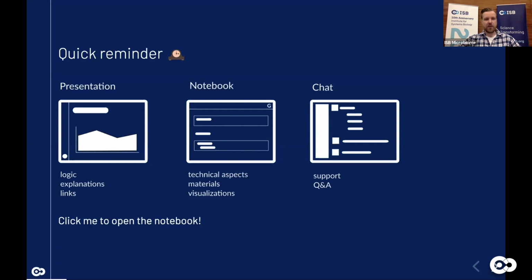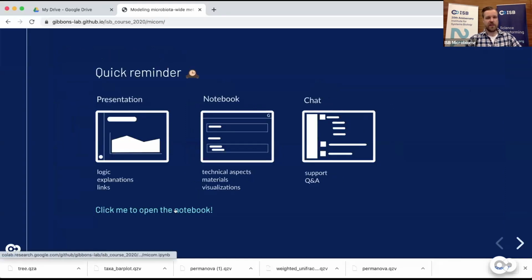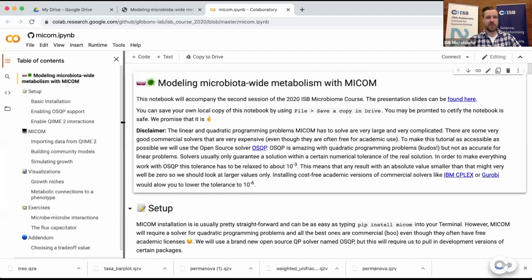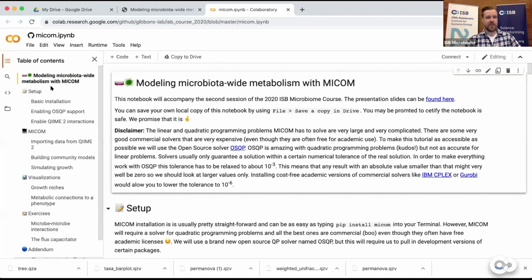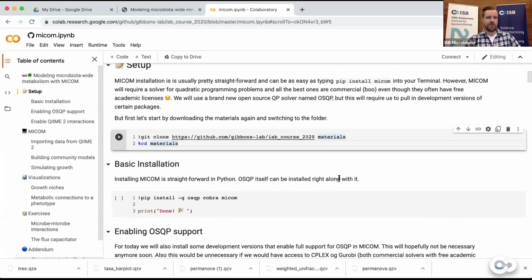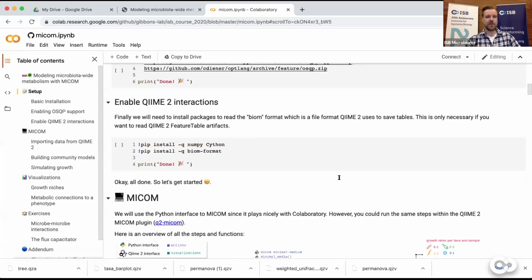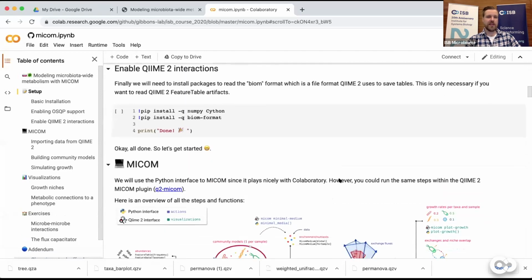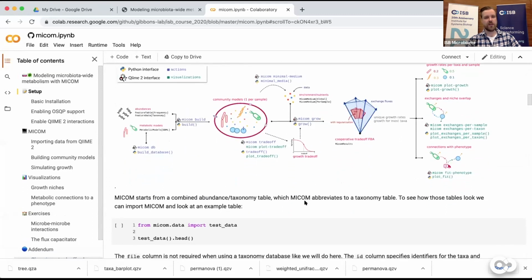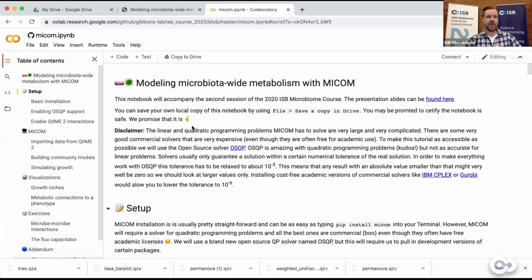Okay, so now we will be opening a notebook again, but now for the second part of the course. I'll be using that link here, but you can also use the link posted in the Slack or the one you received in the email. We're doing exactly the same thing as before. We open up that notebook. It looks pretty similar, with some more explainers. The structure is the same: we have cells that are text and parts that are code. For most of the course, we'll actually be running Python code, so we won't need the initial exclamation mark, only for the first part where we install some things. Later on we use pure Python code.